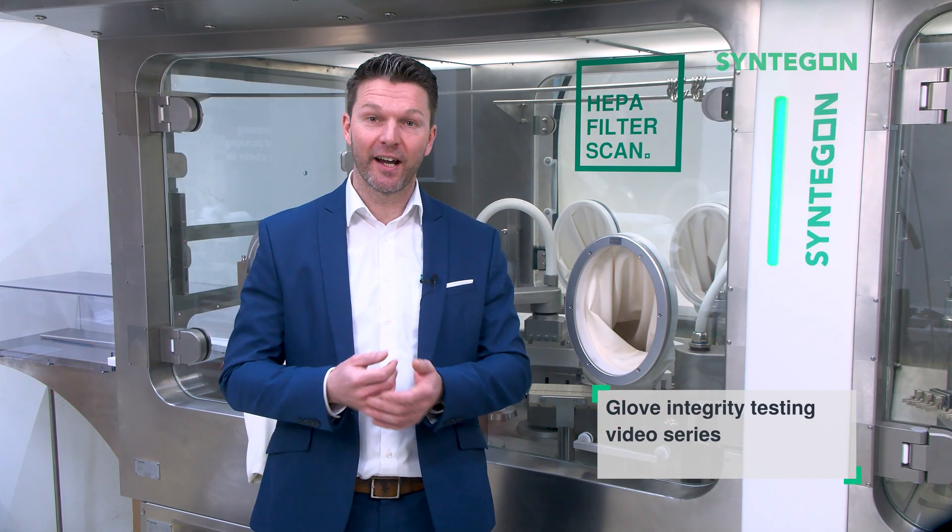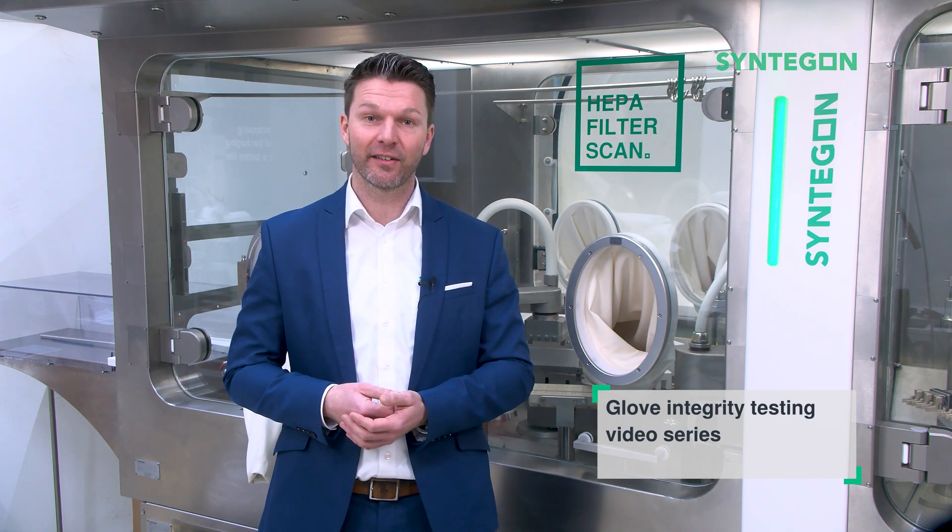Welcome to our glove integrity testing video series. Part 3 of the series is about showing the actual test procedure.